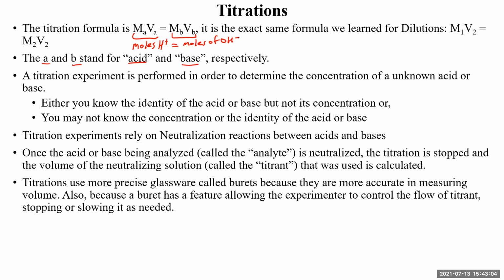If you go even one drop beyond that point, if you let even one more drop of titrant solution react with the analyte solution, this criterion ceases to be valid, and then the formula ceases to be accurate, and then your results are inaccurate.